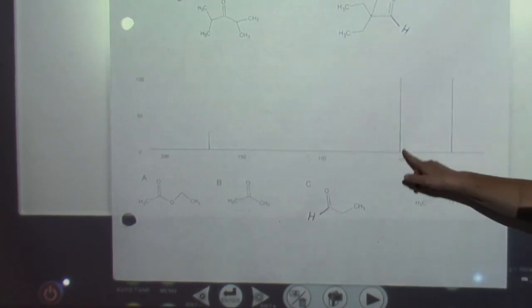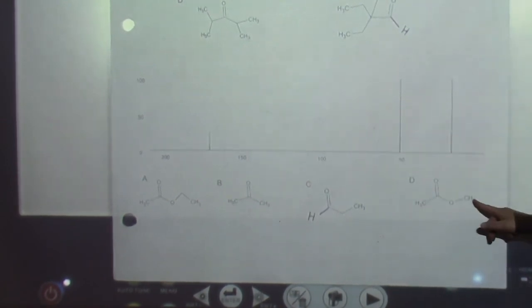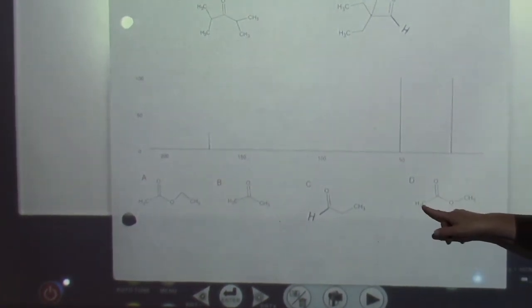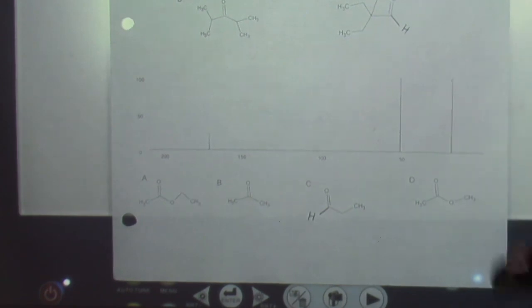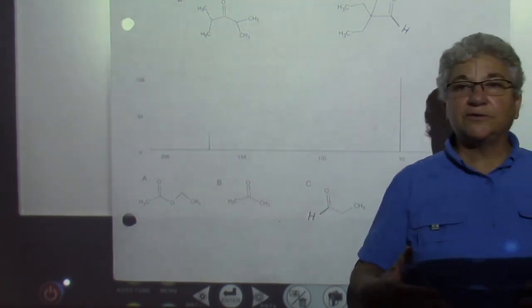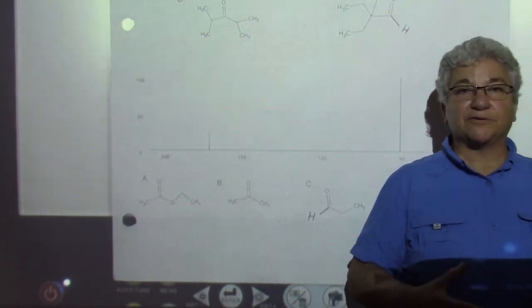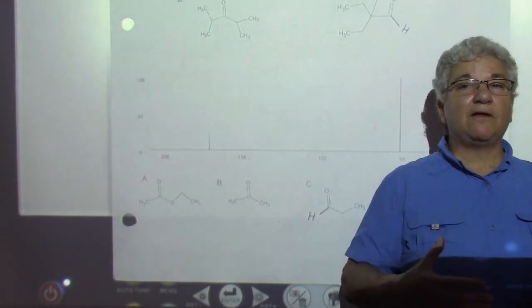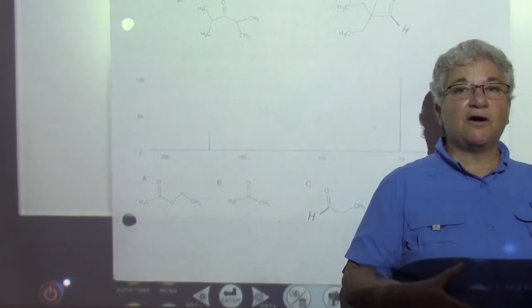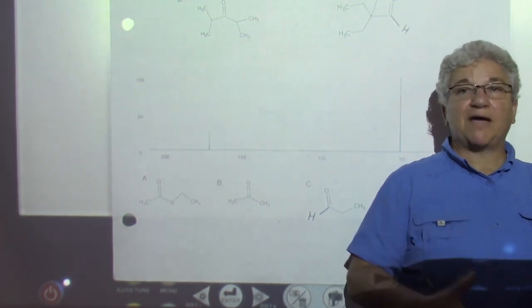This carbon's also pulled down to about 52 or so, which is the carbon bound to the oxygen. We know that pulls it downfield. This carbon here is the upfield carbon. Whew! So that is C13 NMR, right? It's a lot. You have to think about symmetry of molecules. You have to think about chemical shifts. You have to think about a lot for these molecules to solve them. But when you solve them, you know every single piece of data matches what you expect.